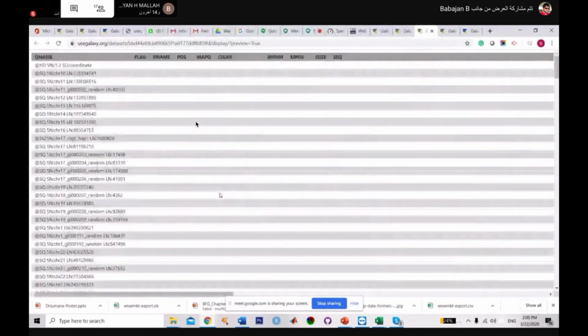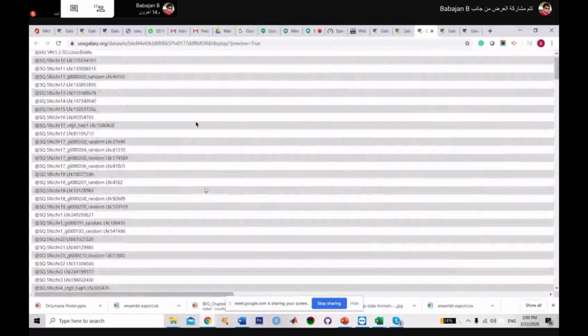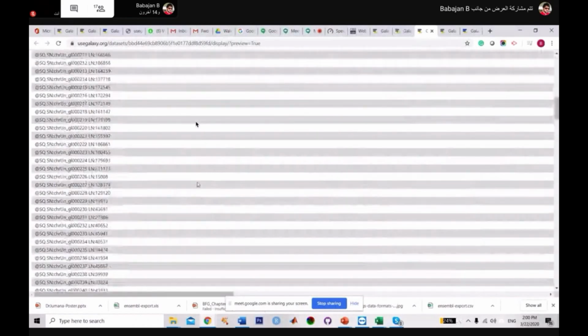Once you align the sequence, it will generate a file. You can see the difference when you work with the FastQ format file, where it shows you a sequence along with the quality scores. Here, what is additional? You can find the chromosome number, and also the position of where exactly the mutation is. So most of the information you will get from here. You'll get some additional information in the SAM or BAM file once it is aligned with your sequence.